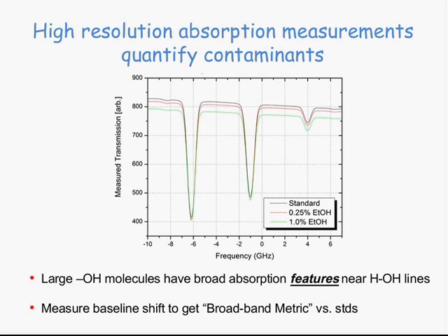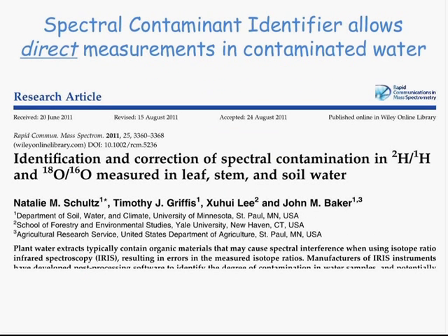There are some applications of looking at water in plants or soil, and right now I understand you have to do extractions offline in order to analyze that. Is there any plan to do an online extraction from soil? I'm sorry, I'm not sure I understand the question. Are you asking me if LGR is planning to have an extractor? Yeah, an extractor attached to your instrument such that you can use your soil.